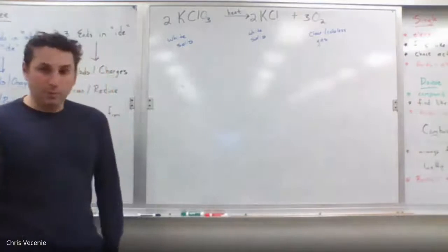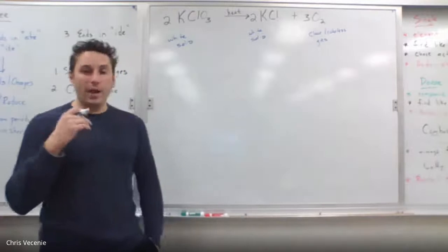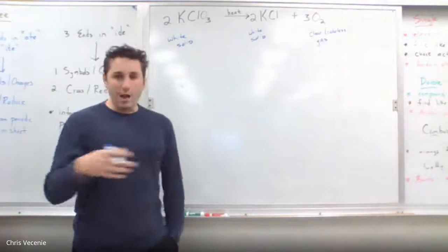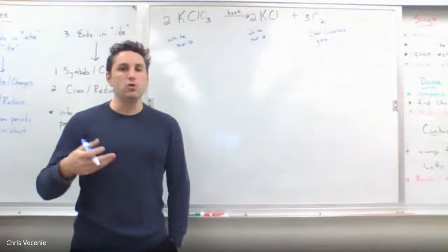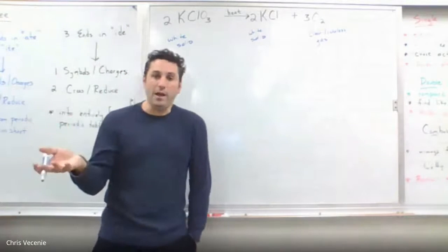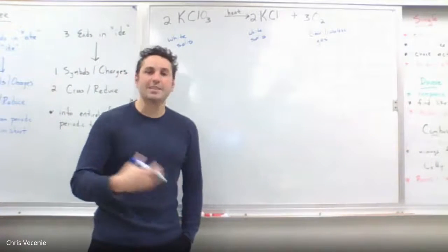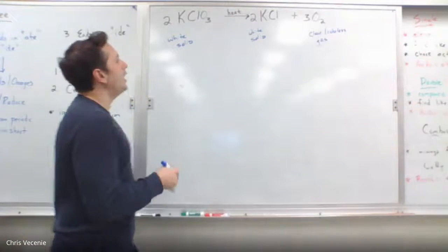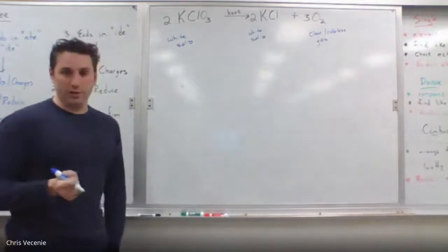To give you a simple everyday example, if I got on the scale and it said I weighed 180 pounds four weeks ago, and then I worked out and it says I weigh 172 pounds now, you know I lost 8 pounds. Well, how do you know it's not there anymore? Because the missing mass had to be the weight that left. Same principle. All right, so what I'm going to talk you through here is in the lab experimentally, how are we going to do that?